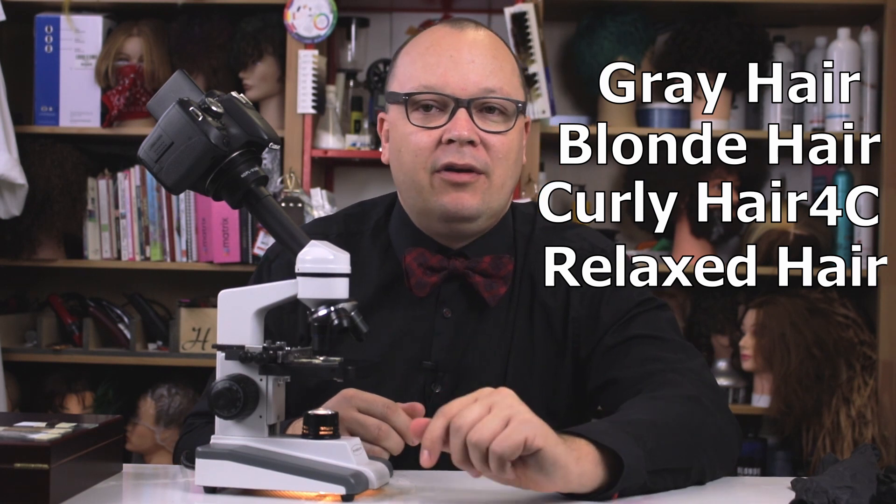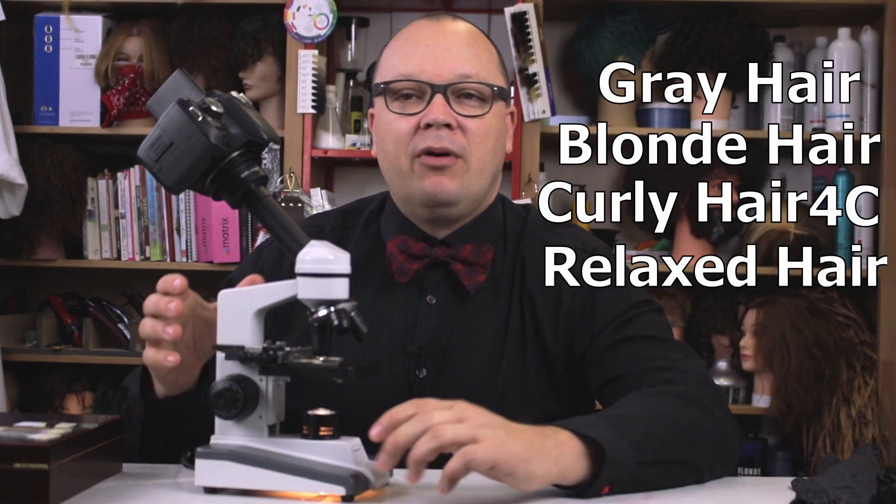It's been relaxed with a potassium hydroxide relaxer. I've got my microscope with a camera attached. It can be difficult to get visuals of hair under a microscope because the depth of field is so shallow — the focus is very hard to catch. But I'm going to try something I haven't tried before and maybe do a video recording of me focusing through this camera.